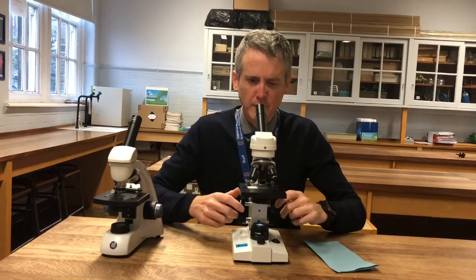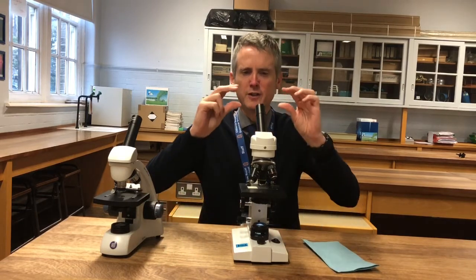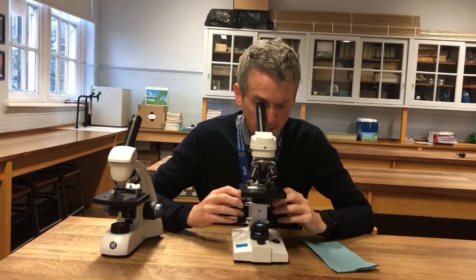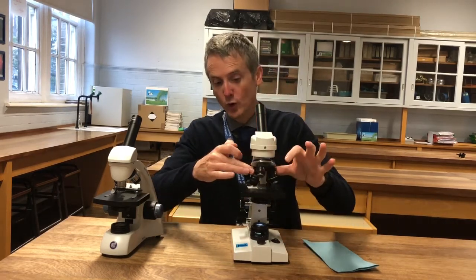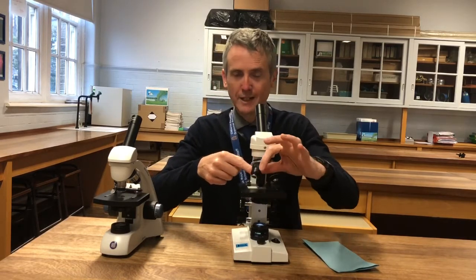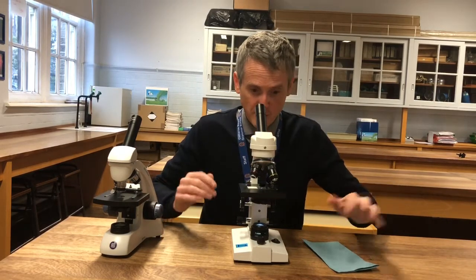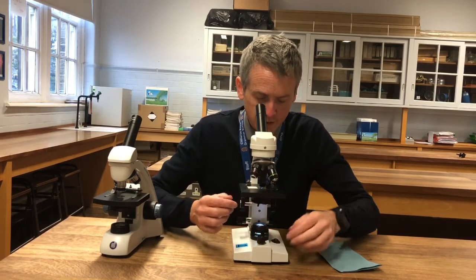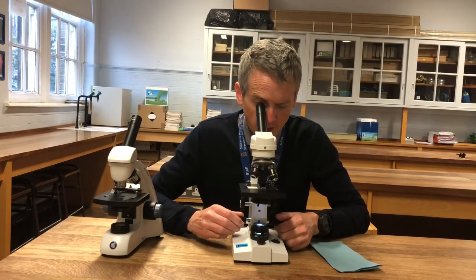I can move the stage down slightly and it comes into focus — about a 3 or 4 degree turn of the wheel. Move it into the centre again. Now I can go to x400. It looks like it's going to hit, but it can't hit — if it's focused on the yellow lens, the blue lens can't hit the stage. I look down — it's blurry and a bit darker, so I'm going to increase the light and reduce the iris slightly to get more contrast. Then I use the fine focusing knob to get it into focus.